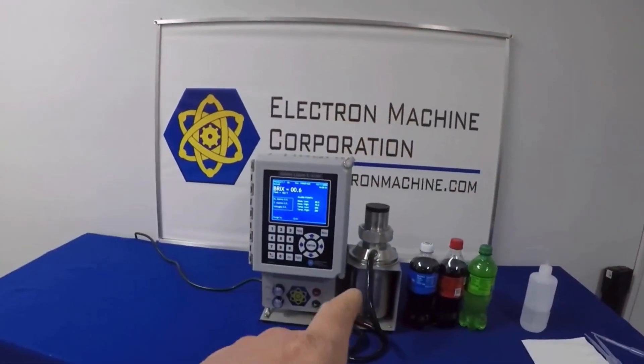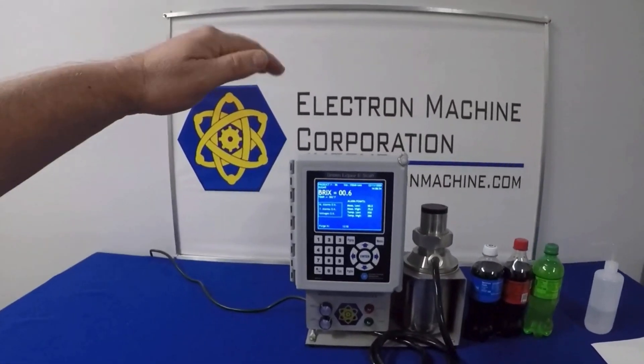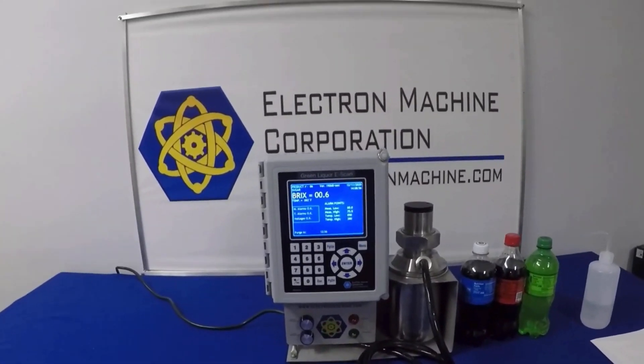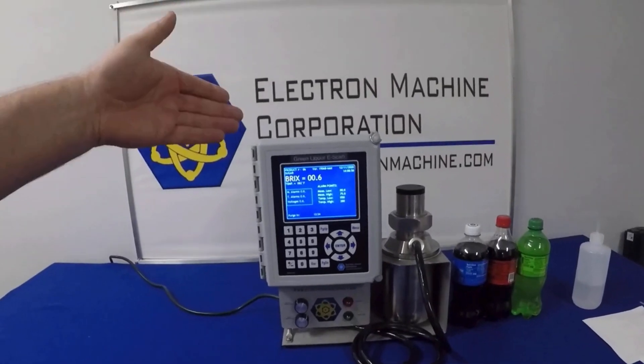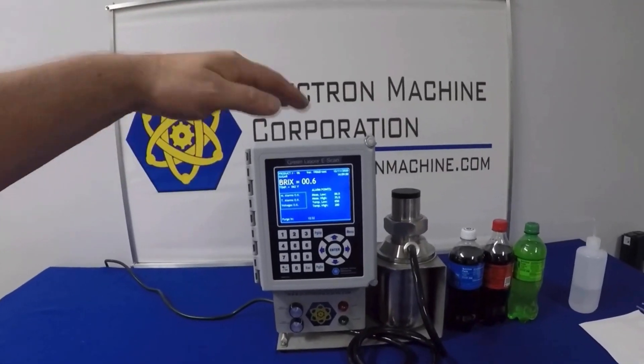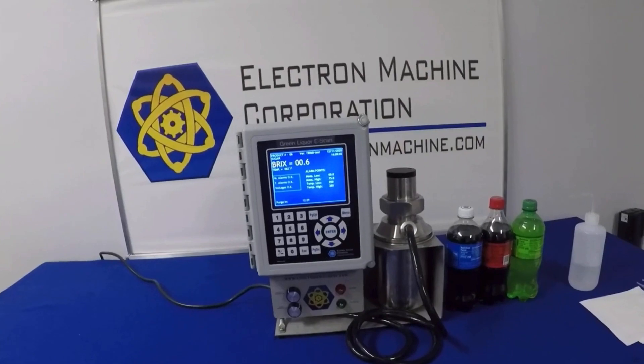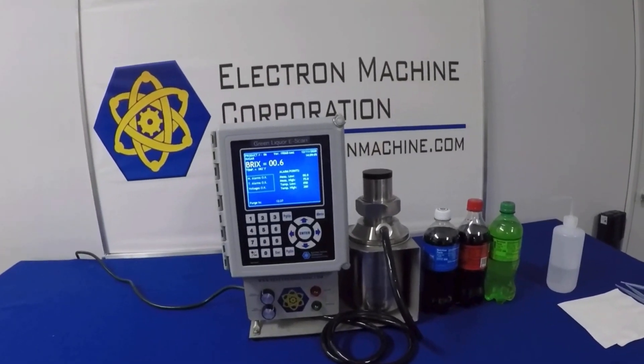So we have a couple popular sodas over here and we're going to show you how our inline instrument would be used to measure this product. The instrument's in a static state. We have a sample cup on there and we will be placing samples on it. This normally would be installed in the process line.